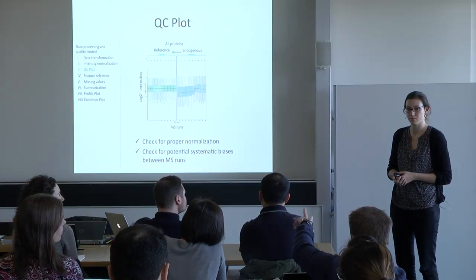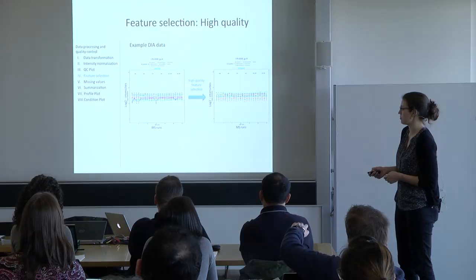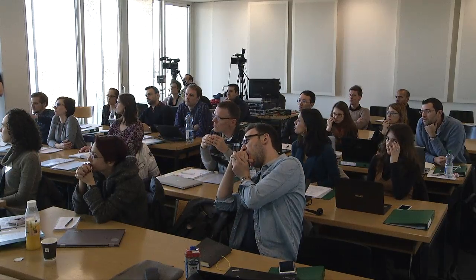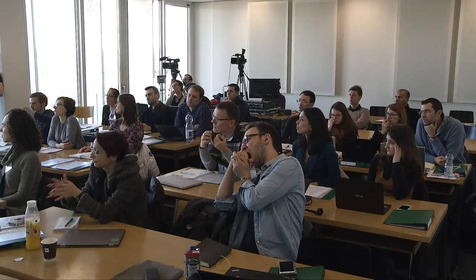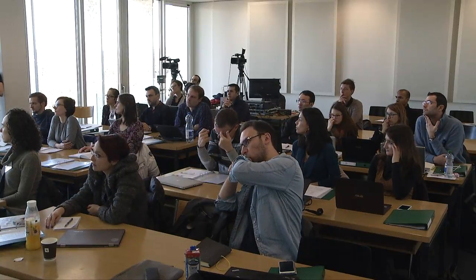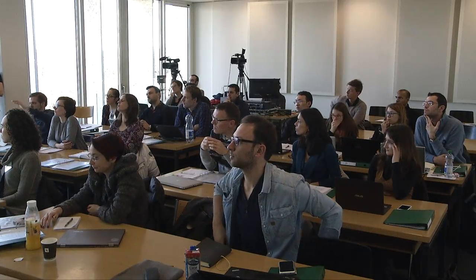Okay, about the feature selection, two slides ahead, this one. So it's always done based on a summed profile of all transitions, and then you look at how all the transitions relate to that. But it's done for each peptide separately, right? Because in the plot you had all of them in one, but still the comparison is always between the peptide and its corresponding transitions, right? Exactly.